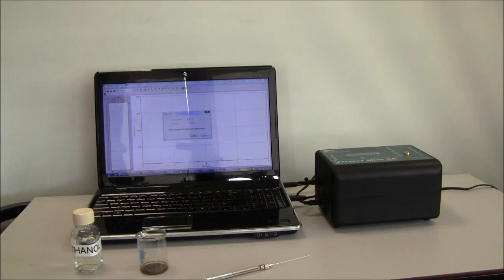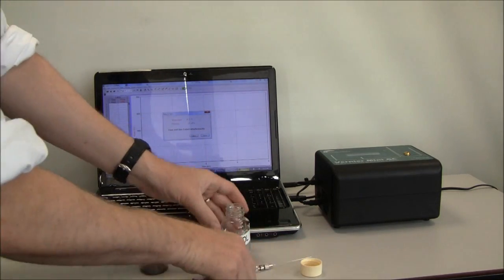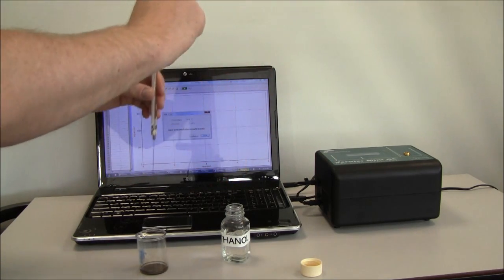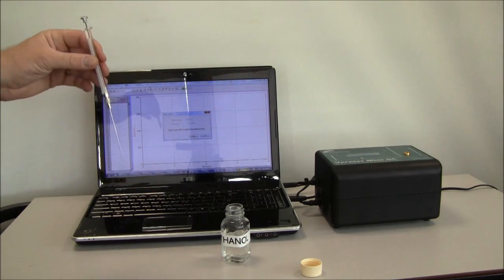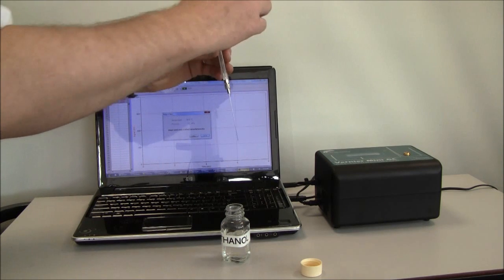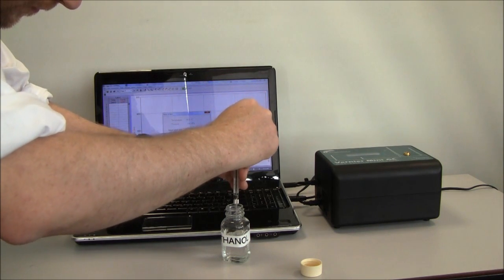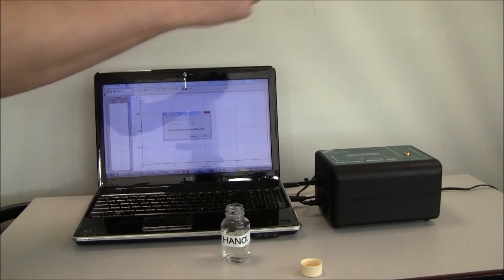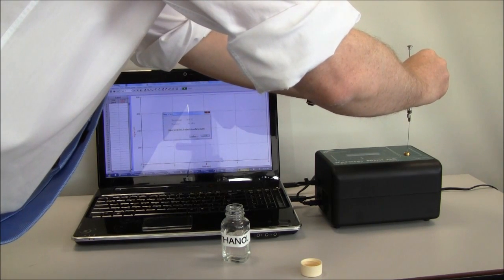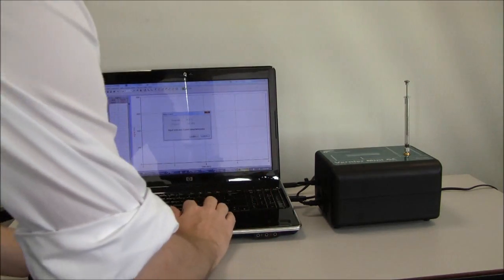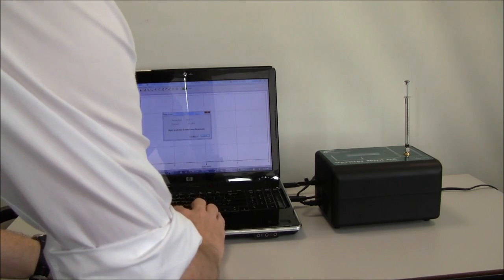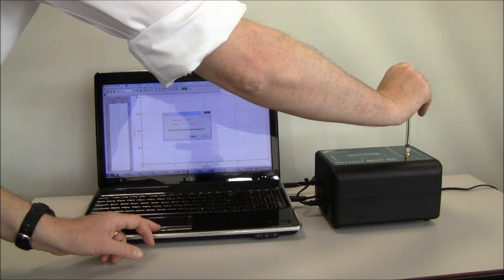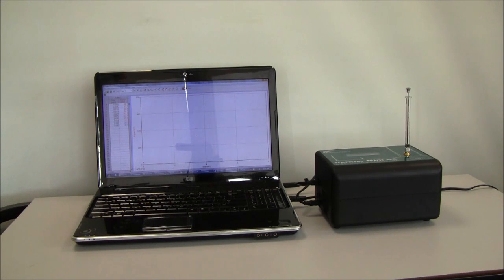Okay, so the gas liquid chromatograph is ready, I'm just going to put the ethanol through. First I'm just going to give the syringe a little clean. Now I'm going to take a 2 microlitre sample. Great, now I'm going to inject that into here. Alrighty, I'm going to simultaneously inject it as I click collect. Okay so the sample's gone into the gas liquid chromatograph, and I've set it for 8 minutes.